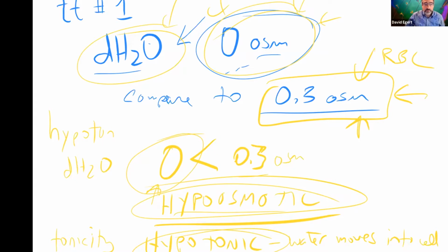So test tube 1. I understood tonicity as only if a solute can't penetrate the cell. No. Tonicity is water moving across. Hypotonic means water moves in. Hypertonic means water moves out. And isotonic means there's no net movement of water. I understood that, but as I was looking at the definition of tonicity, it is only relevant if the solute is non-penetrating. Am I understanding this correctly?